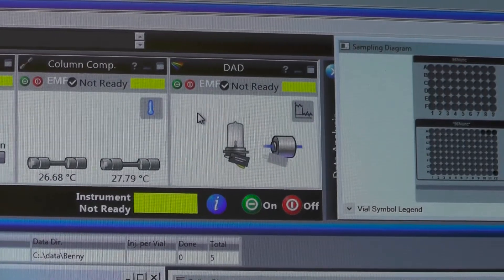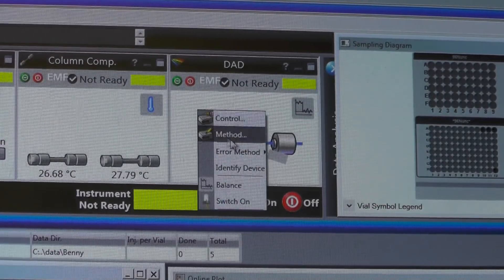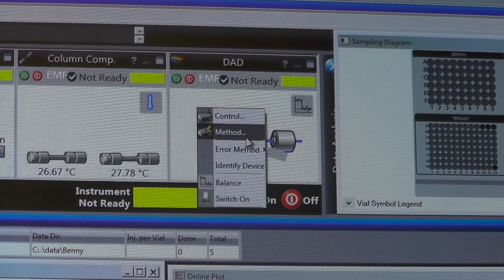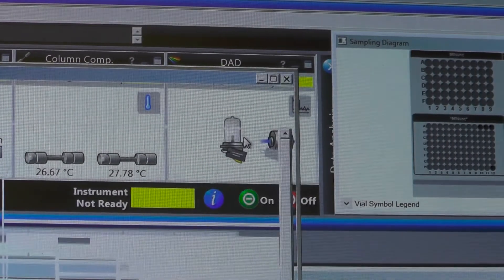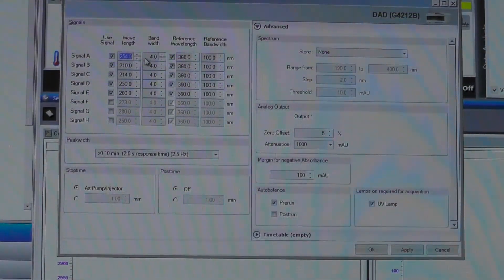If you need to change the wavelength of the DAD detector, right-click on the DAD icon and select Method. If not, you can skip this step.